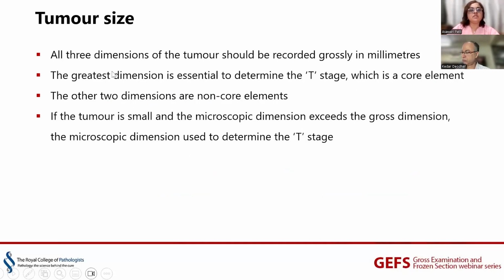For tumor dimensions, how to take them grossly: all three dimensions, and we have to measure them in millimeters. Greatest dimension is essential, but the other two dimensions should be given. If the tumor is small, then microscopic dimensions need to be mentioned.